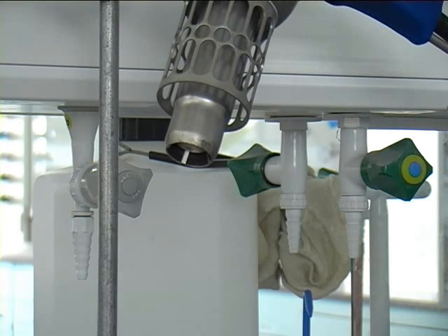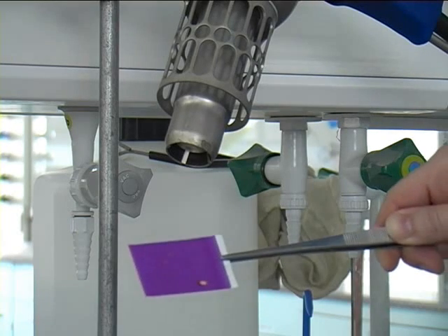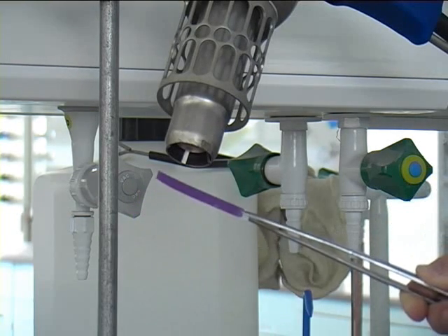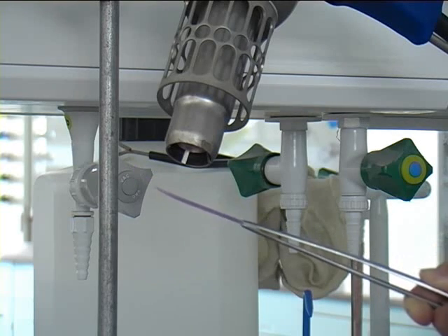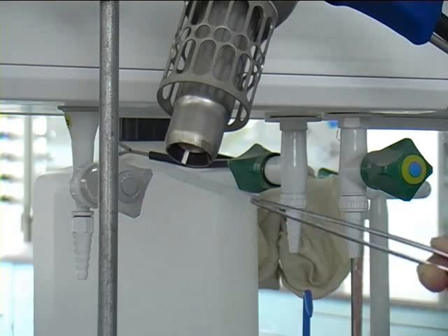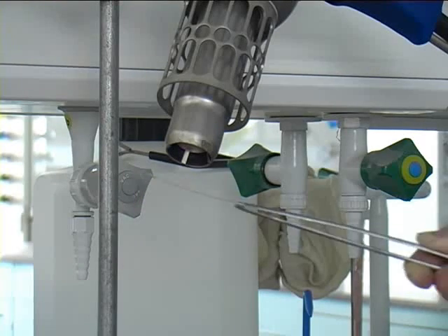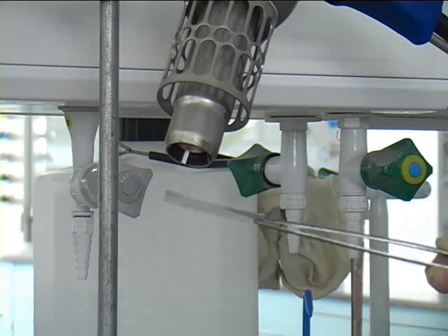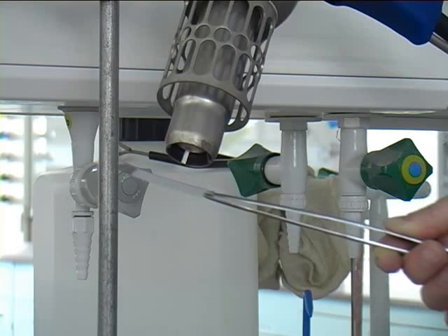This is shown here. That's at room temperature. After you've started heating some time, the TLC plate will dry gradually, and slowly some spots will develop. If you have a substance on the TLC plate, that can be oxidized.